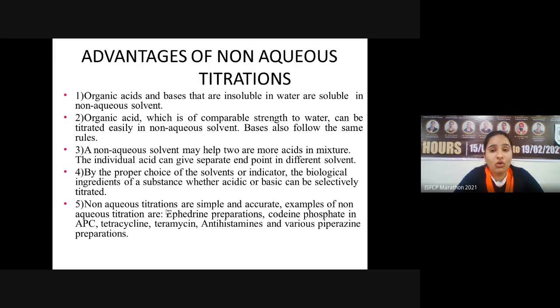We cannot get a homogeneous solution. If you cannot get a homogeneous solution, then the titration is not possible, because for performing titration there is always the need for homogeneous solutions.